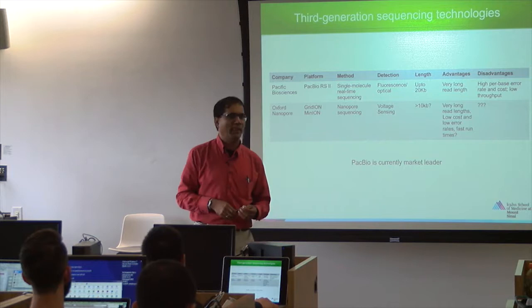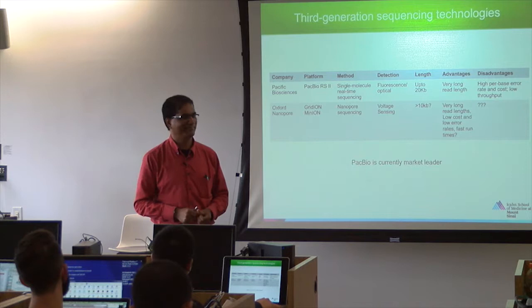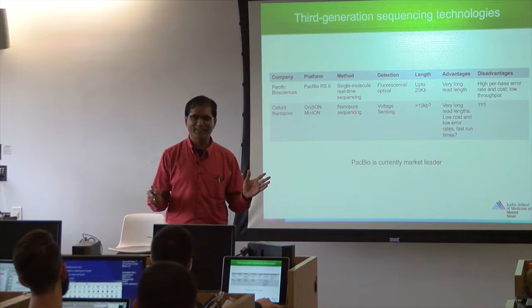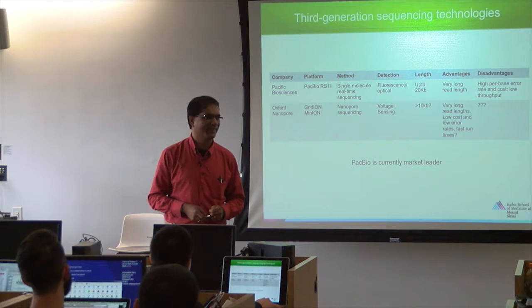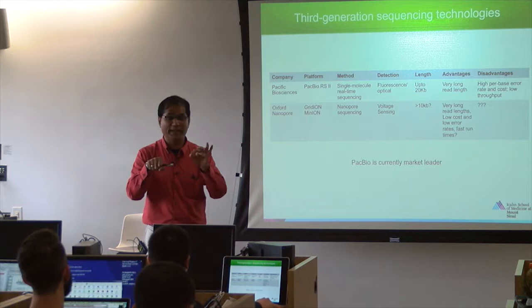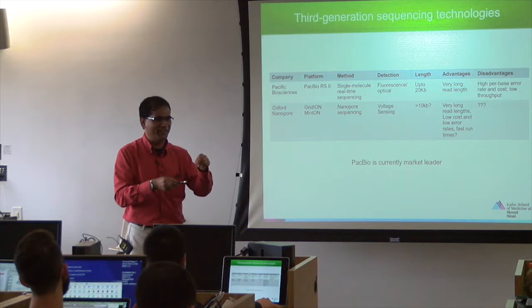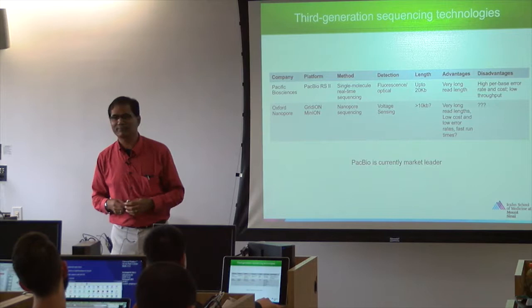Now, to increase the read length, people thought, instead of taking snapshots or scanning, why can't you videotape a biochemical reaction? Have you ever heard of this? Anybody thinking like that? Videotaping a biochemical reaction? That means, as the polymerase is adding bases, let it add bases, no stoppage. Let it keep adding bases, not one base at a time, no reversible dye terminator. And I want to take a video of that. In that video, it should say A is added, G is added, C is added, T is added, A. Then I want to videotape that. Isn't it revolutionary? Cool concept? It's a good one.